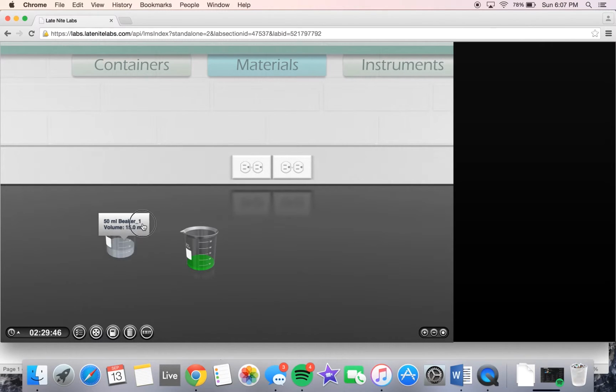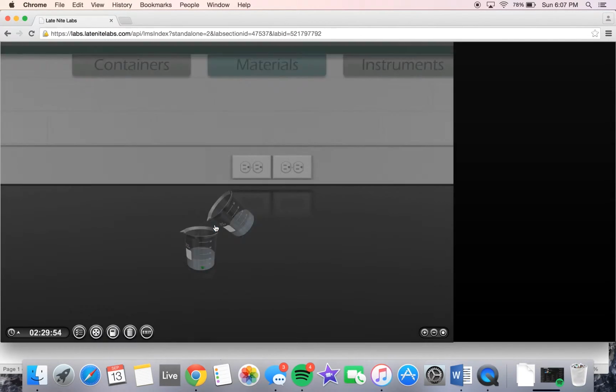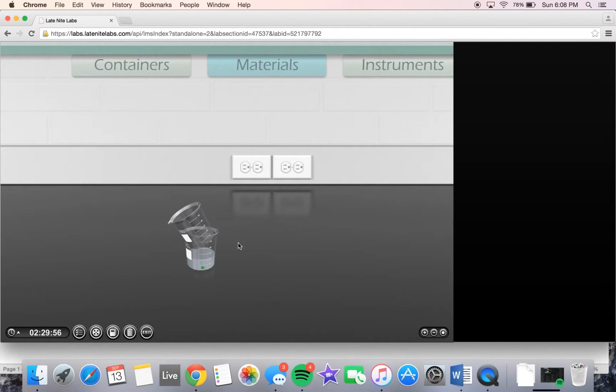Now if I pour the sodium hydroxide into the nickel 2 chloride, we can see that our double displacement reaction occurs. After the reaction occurs, we can see that there is an aqueous solution that is gray and a green precipitate at the bottom that has formed.